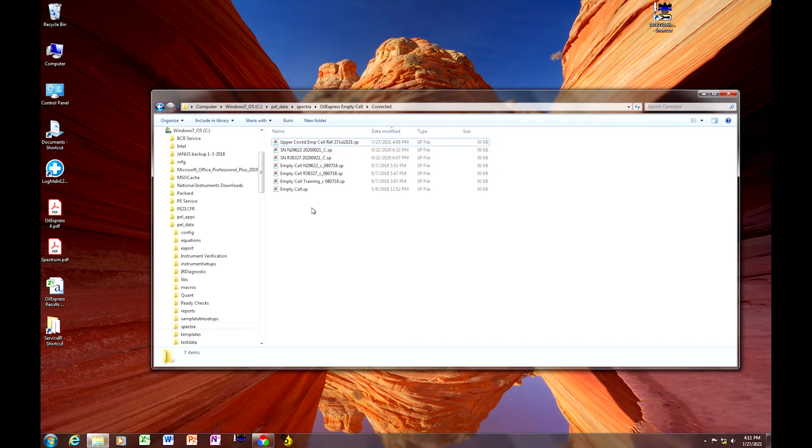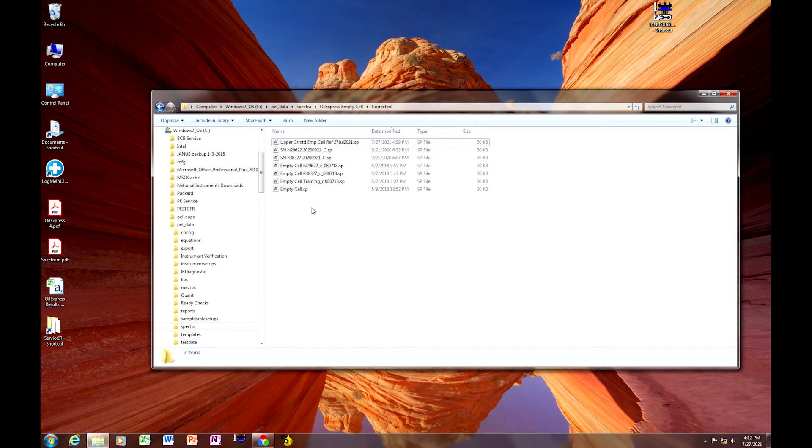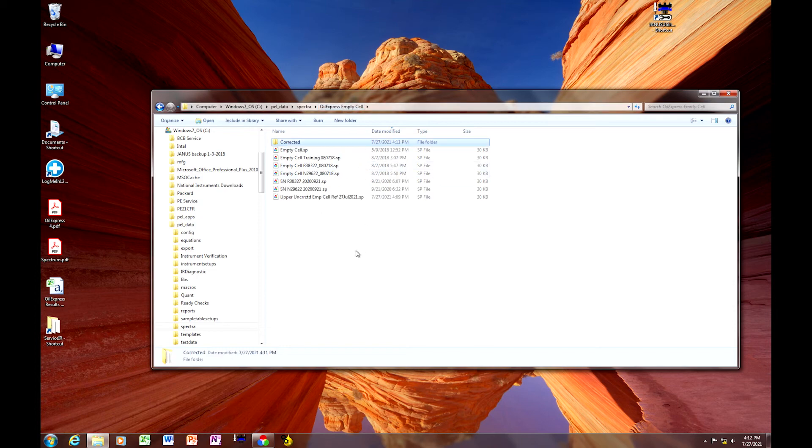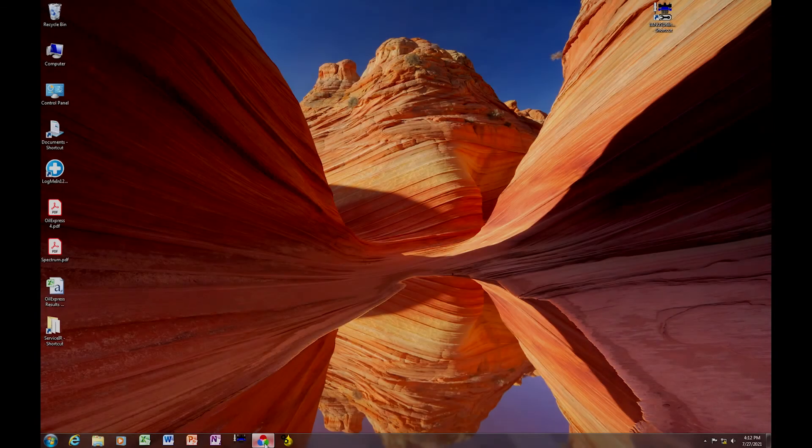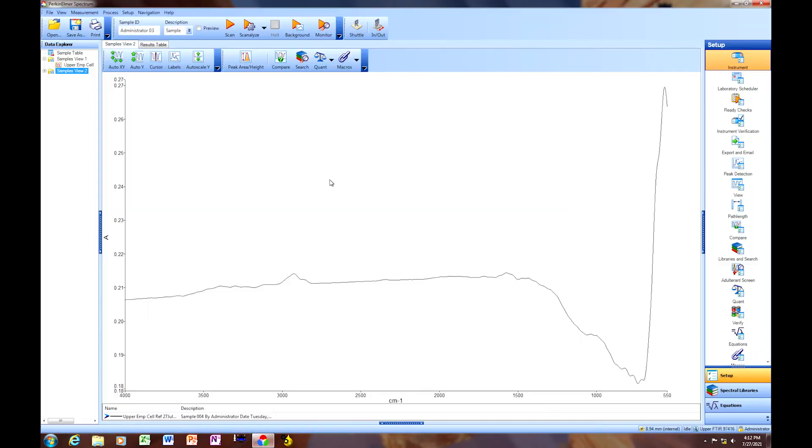The reason being, once these are applied in the oil express software, that makes it very easy to understand whether or not you've applied the correct reference spectrum, or the empty cell reference spectrum. They are named the same, they're just under different folders if you leave it as it is. So renaming them is always a good practice.